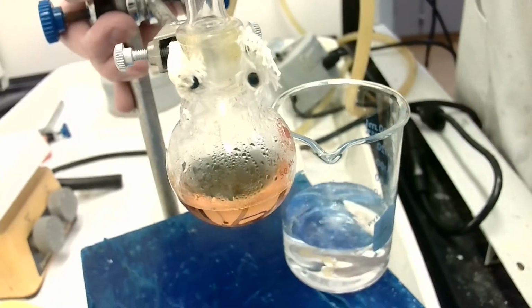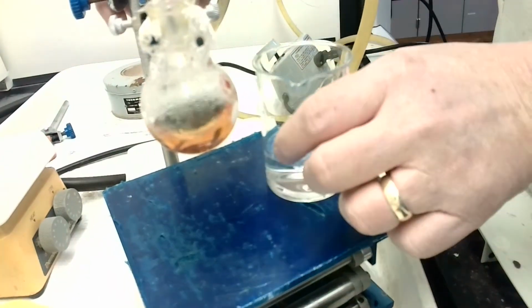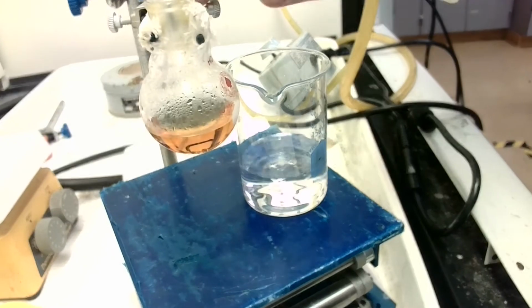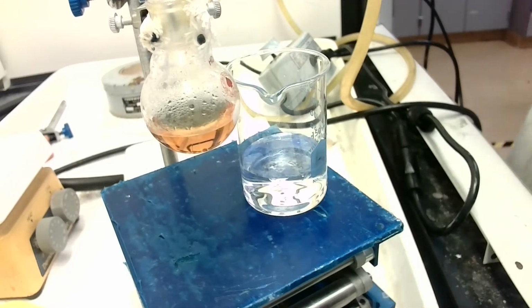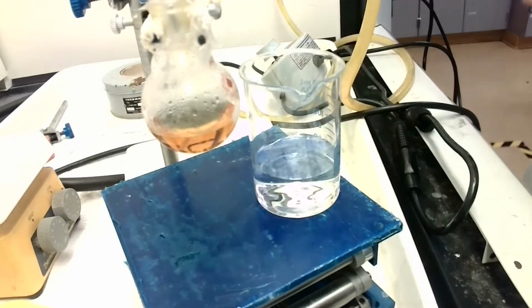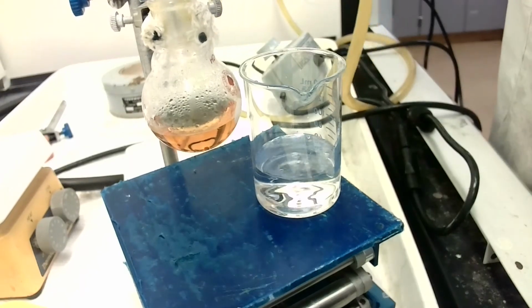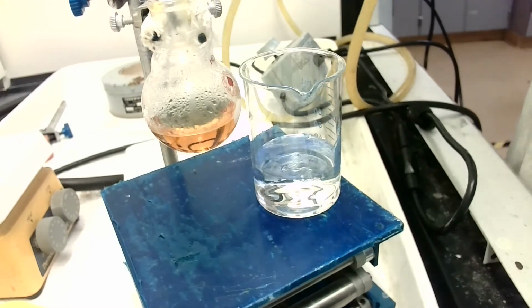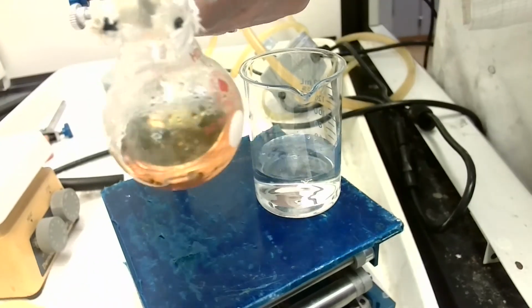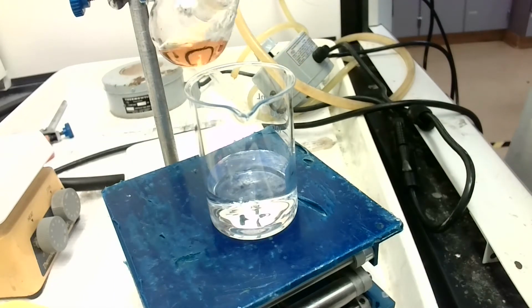I'm going to back up just a little bit. Can you still see that? Yep. Twist this over. All right. Once it stops dripping, we can disconnect, and we're going to pour the entire mixture into our ice water here, and it should immediately turn into white crystals if all went well. So first disconnect the condenser. That looks good. Now we're going to take, and again, because this is boiling hot, we're going to use the clamp and pour it all into here. Can you see this? Yep.